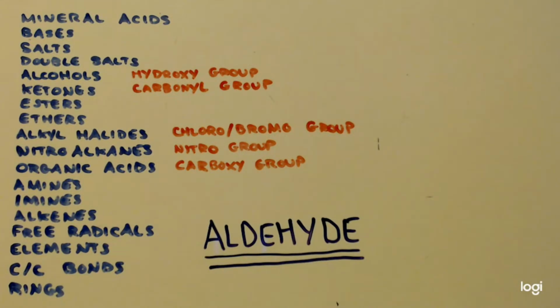So if you noticed my last experiment from last year, I tried to make acetaldehyde. I did make 8 milliliters, and then the second time I did it, I doubled my yield because I used half as much ethanol, and I got 8 milliliters again. So I have made it, but it was a crappy yield. I started out with 400 milliliters of ethanol in the first one, and 200 milliliters in the second one. To get 8 milliliters each time, that's not good.